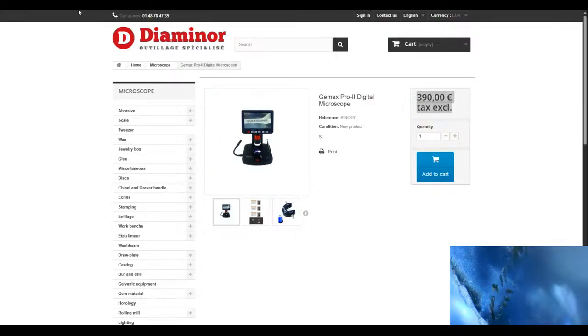In the end, Carl Zeiss produces their optics also in China. It's just assembled in Germany, so it's... nah. It's not all of these terms they put into your brains, 4K, 1080p, etc. This is all nonsense. It's about the resolution of the optic, not the resolution of a sensor.